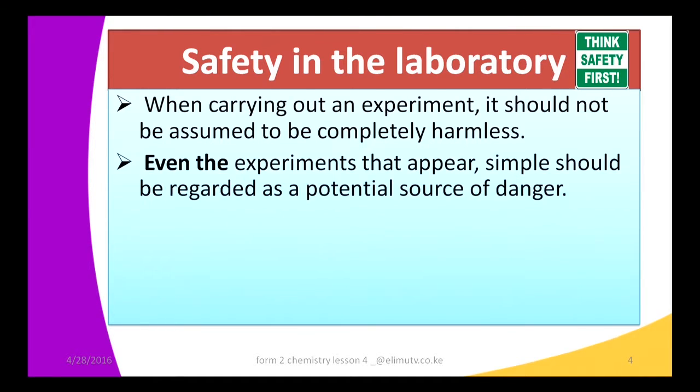The other thing that we have to note about safety in the laboratory is that even the experiments that appear simple should be regarded as a potential source of danger. You are just doing a demonstration in the lab, and maybe you assume that demonstration is very simple, it cannot pose any danger to you.